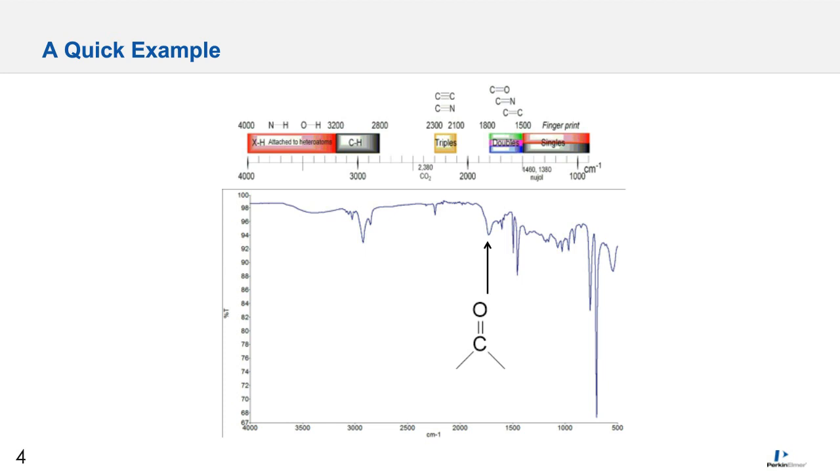Then towards the right of that, we come across a carbon-oxygen double bond, which is a carbonyl functionality. So in aggregate, the bonds that we see here are representative of a material which is acrylonitrile butadiene styrene polymer, or ABS, with some sort of impact modifier.